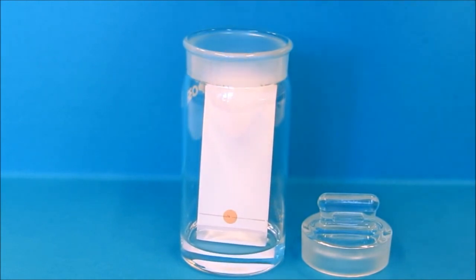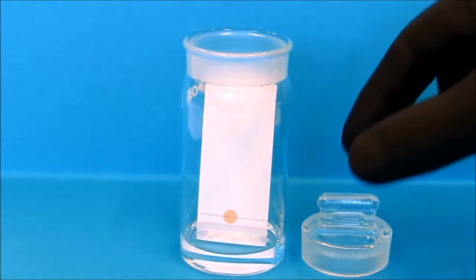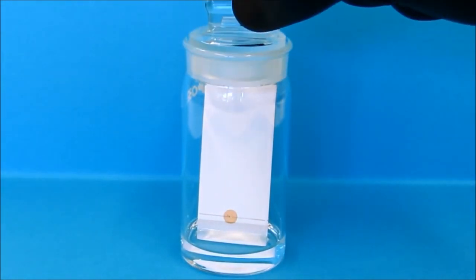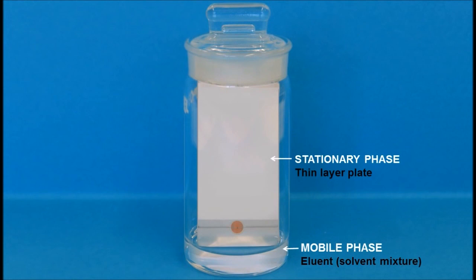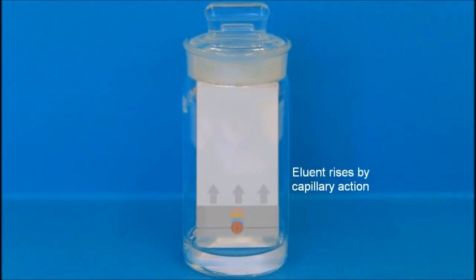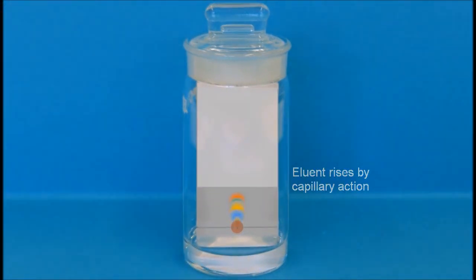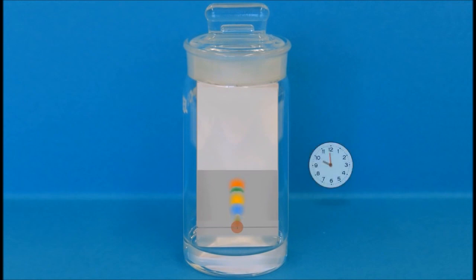Then put the plate in a jar containing the mobile phase. The mobile phase is moving upward through the stationary phase particles due to capillary action in the tiny spaces between the particles of the stationary phase.